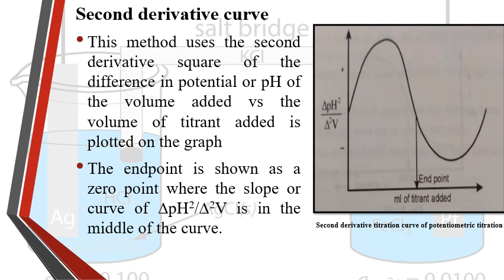You compute the second derivative to identify the inflection point, which can provide more accurate information about the region where the sensor's response is most sensitive to change in the concentration.